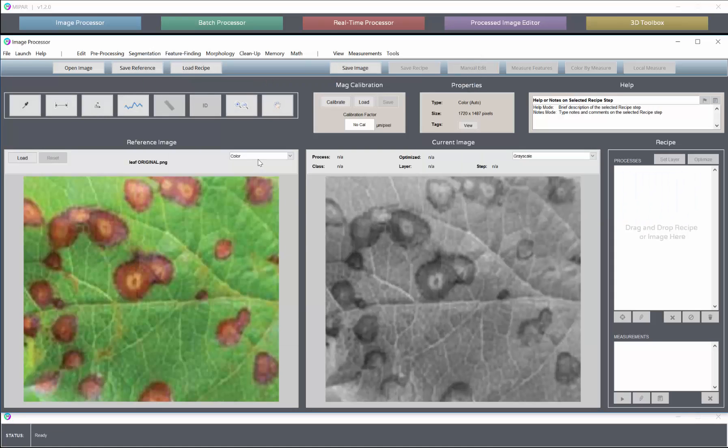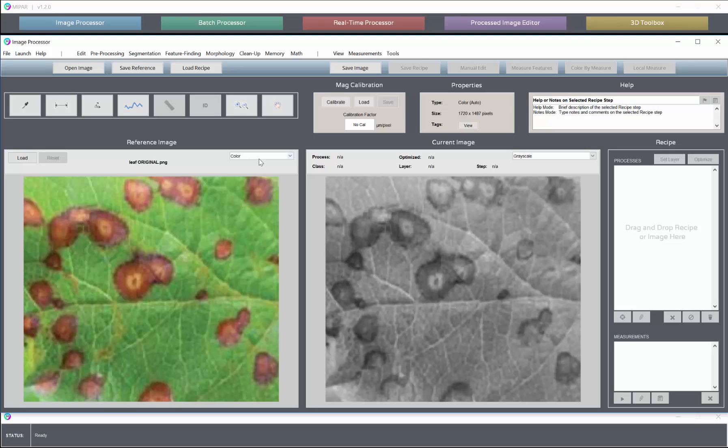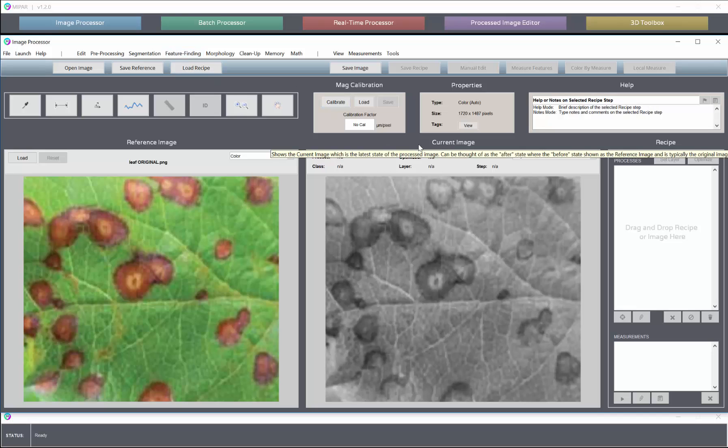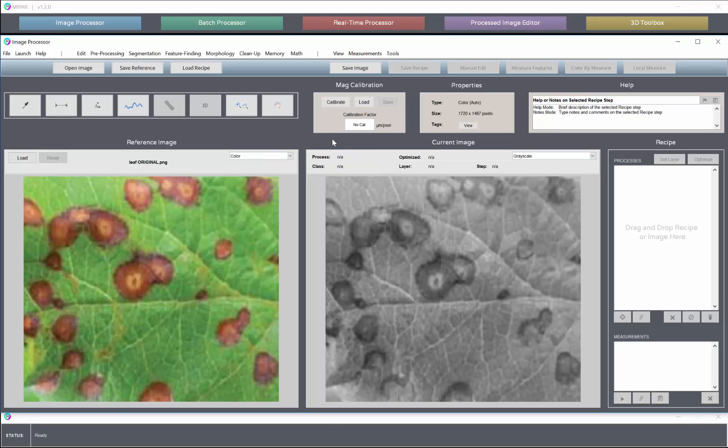Now as you've likely come to be accustomed to, a recipe is a sequence of black and white or grayscale steps. The black and white steps represent selection steps that are selecting portions of the image. The grayscale images are manipulations of the raw intensity.